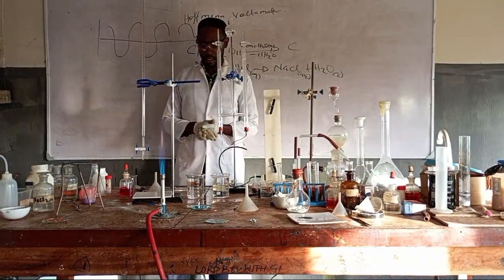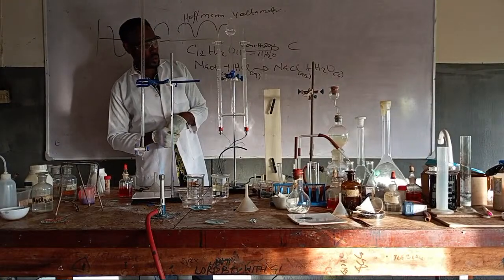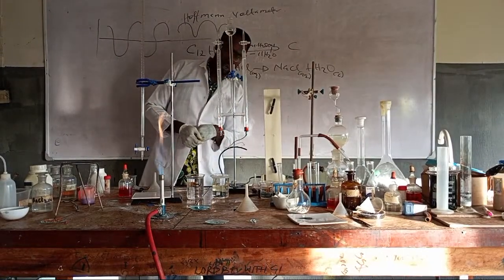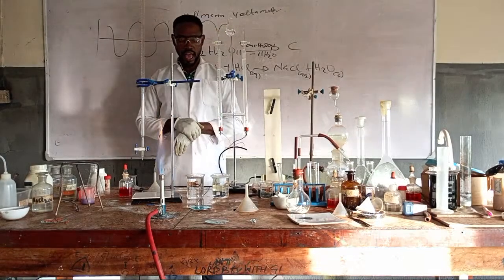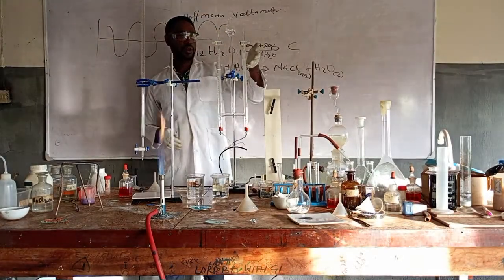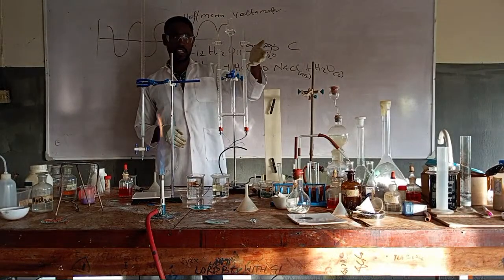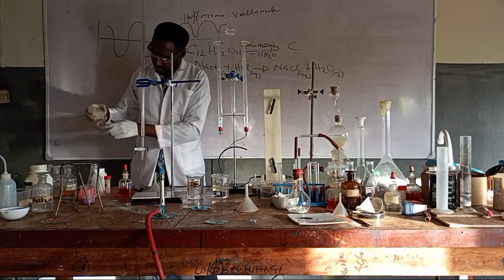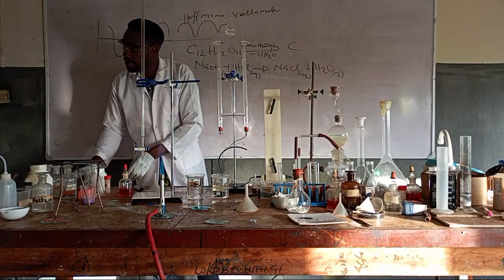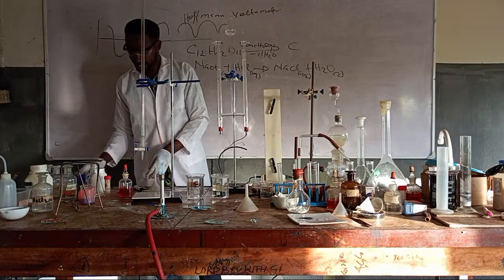Okay, it's time to collect our oxygen, but let me be patient for you. I want oxygen to be more. As we are waiting for the oxygen, the hydrogen is collecting as fast as possible. Okay. Is it time? Okay, that means we are ready.